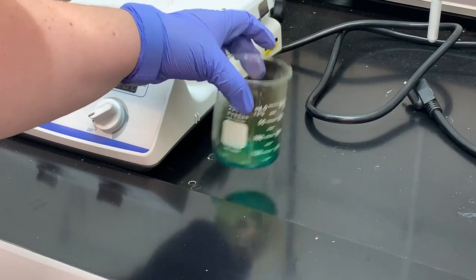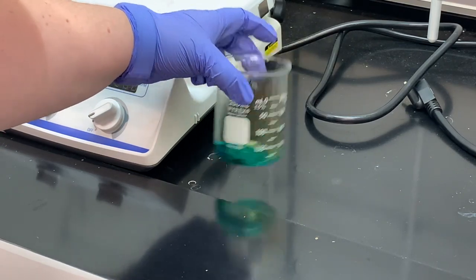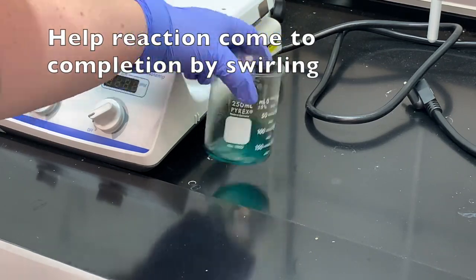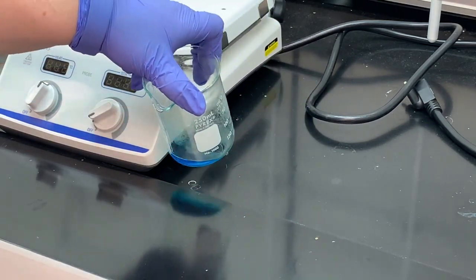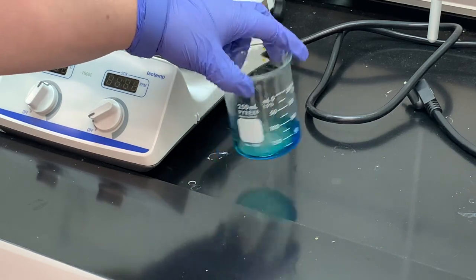As I'm doing this, you can see that gas is still coming out of that reaction. It's kind of brown, that brownish gas is still coming out of that beaker. Okay, so I think our reaction has subsided now. So now this blue and the blue on the hot plate do match up a little bit better. So we're ready to add the water.